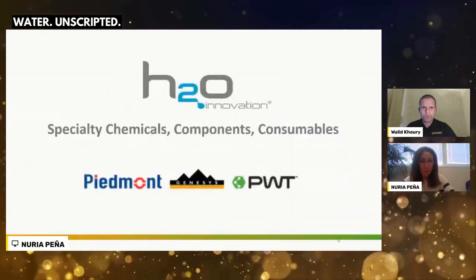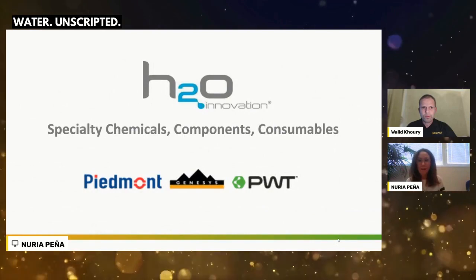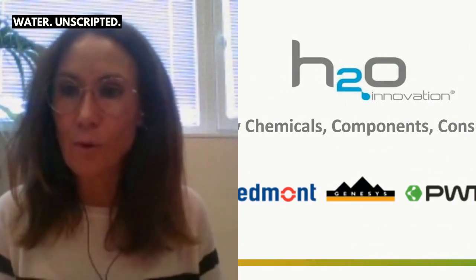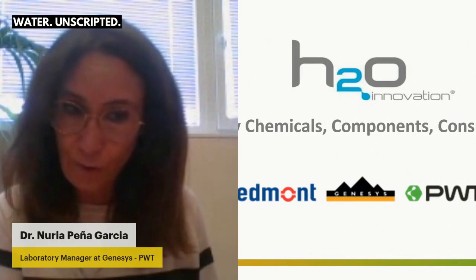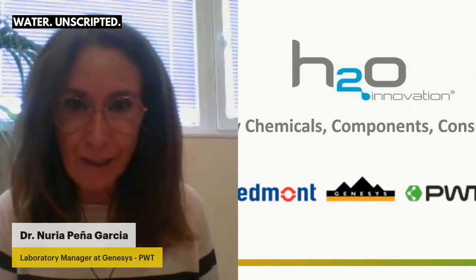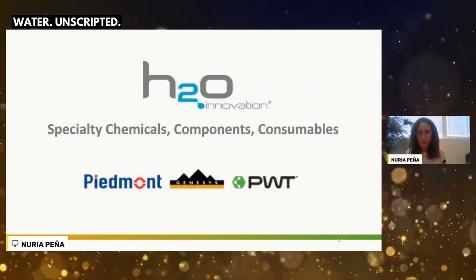I work in H2O Innovation as part of Genesys, and within H2O Innovation there is a group of companies working hard to provide specialty chemicals, components, and consumables. We have 3 laboratories. One of them is based in Manchester, more focused on the research and development of chemicals. Another one is in San Diego, in California. They work both on the development of chemicals and on membrane autopsies.